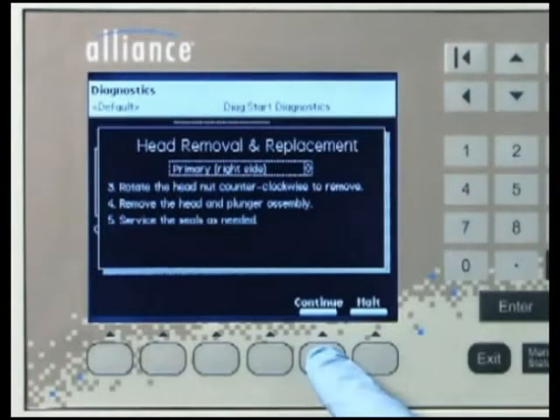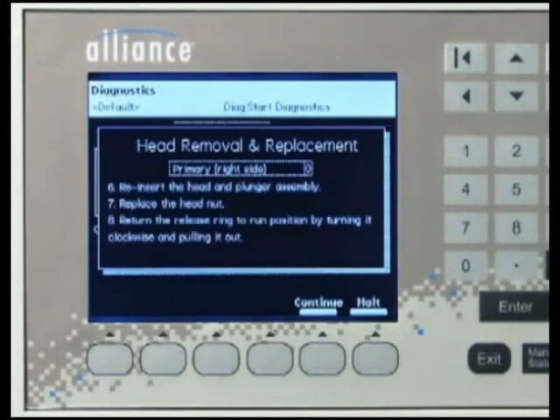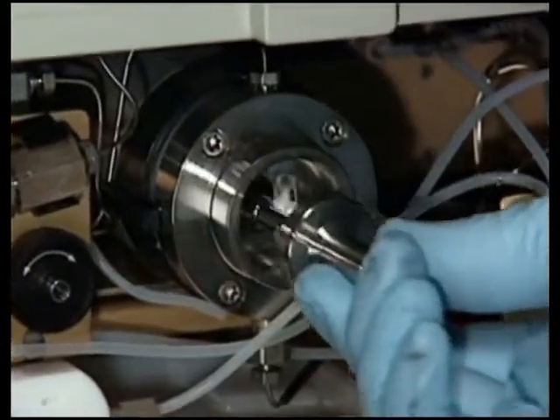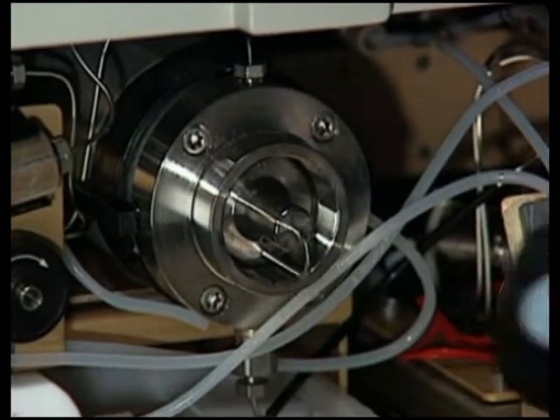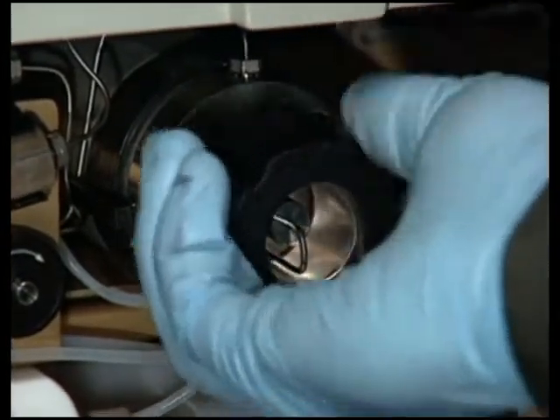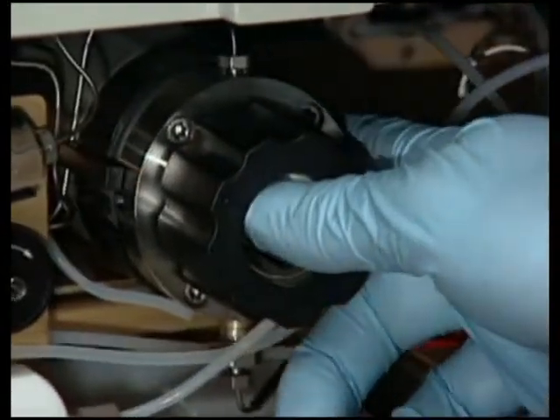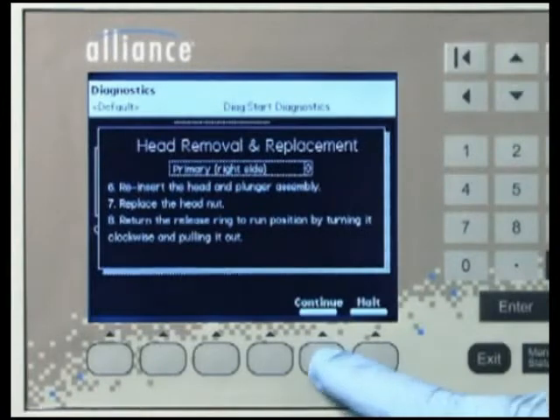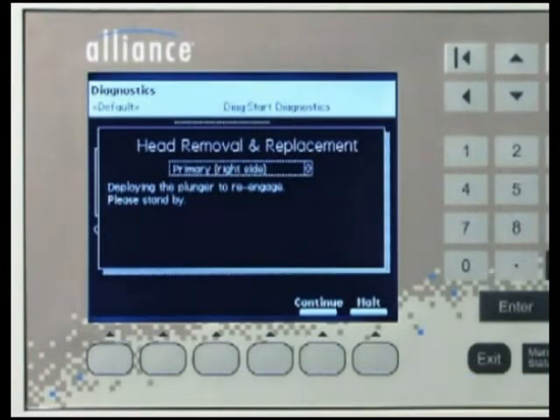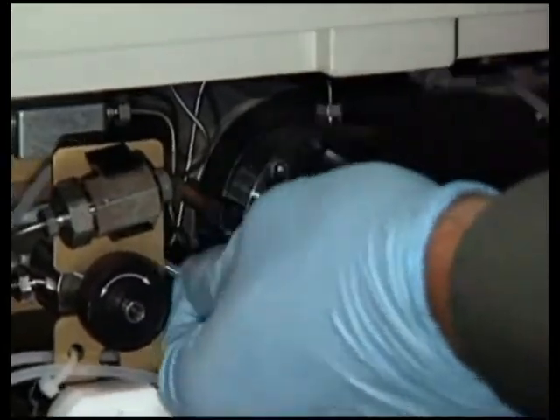Press the Continue screen key and the 2695 displays instructions to reinstall the components. First, insert the plunger and head assembly into the cavity with the J-tube facing down. Replace the head nut and turn it clockwise until the head nut is tight. Return the release ring to the run position by turning it clockwise and pulling it out. Press the Continue screen key and the 2695 engages the plunger. Firmly press the seal wash lines into the manifold to properly seat the lines into the new wash tube seals.